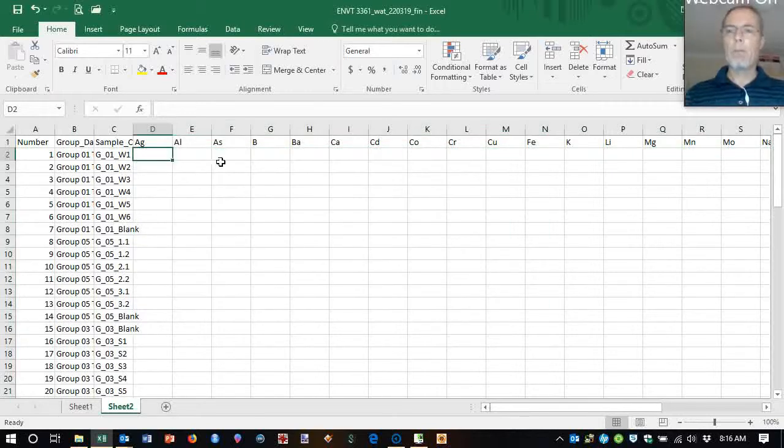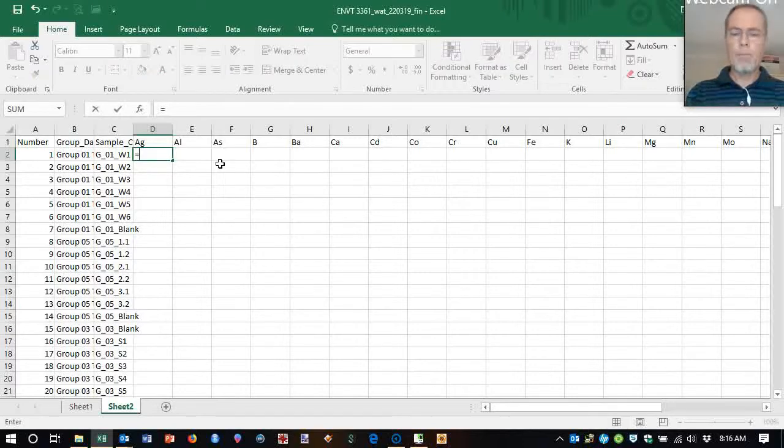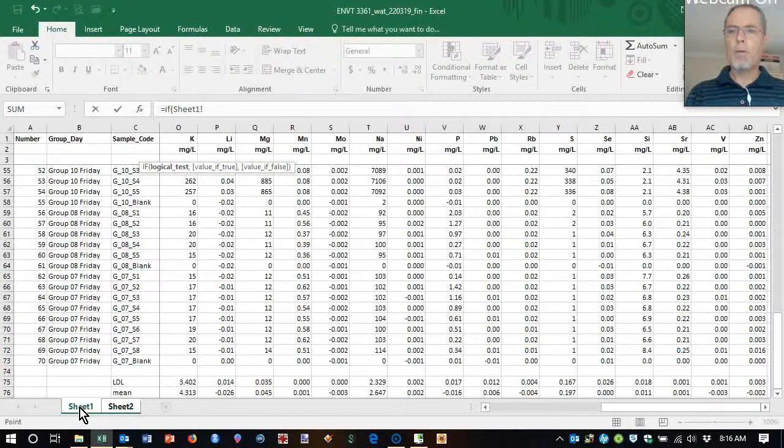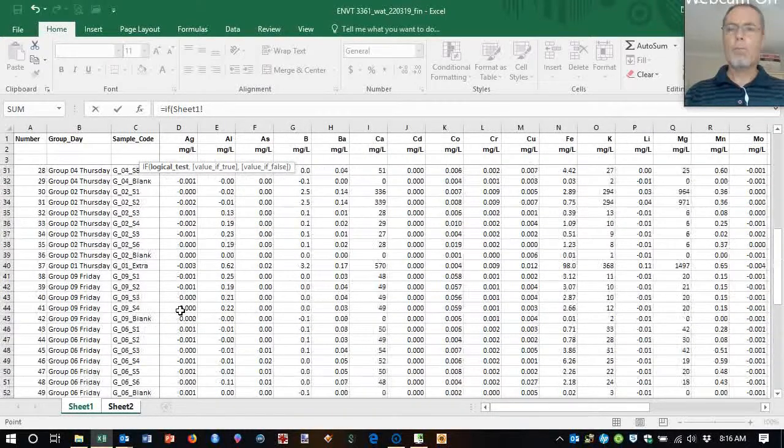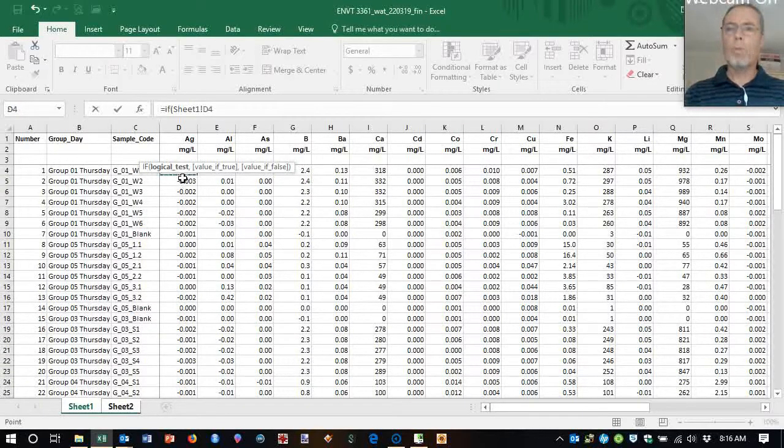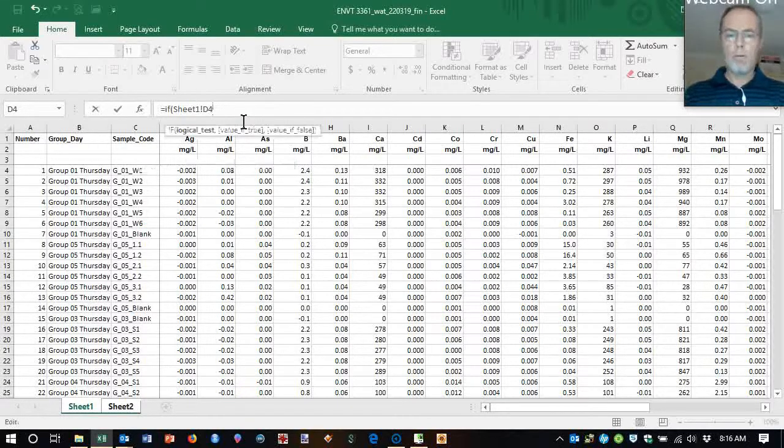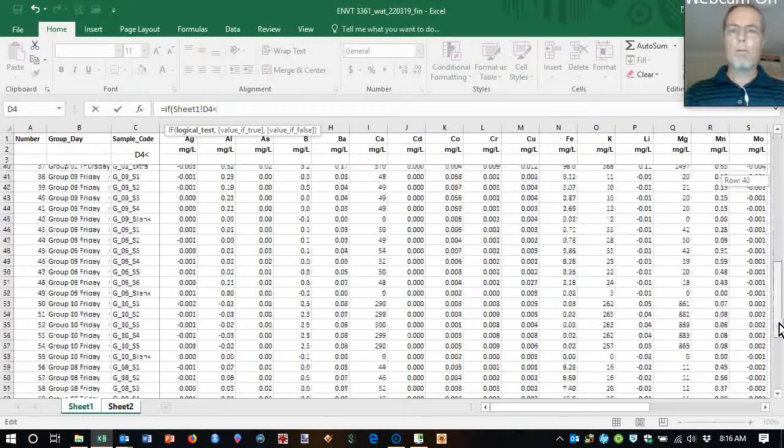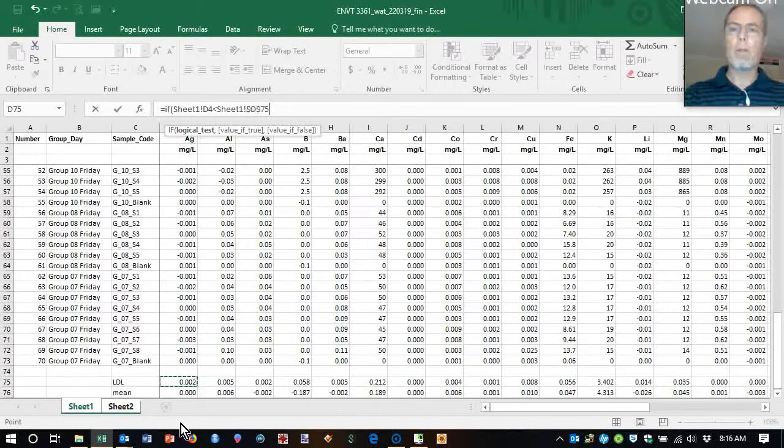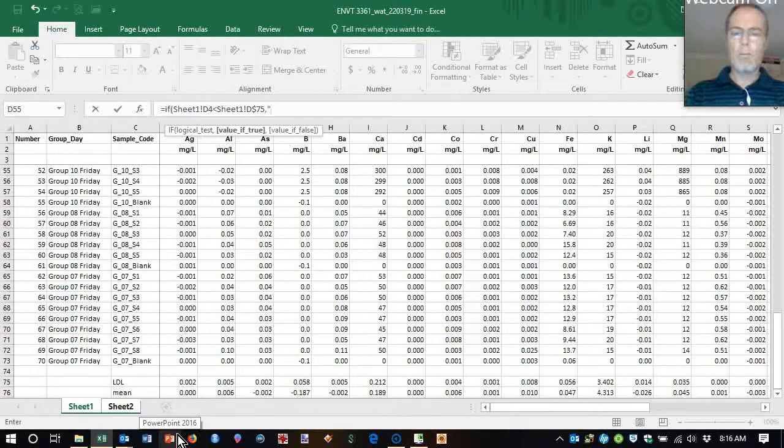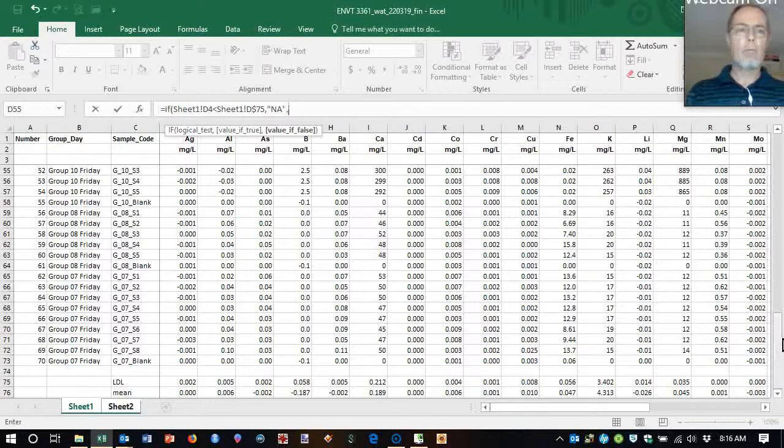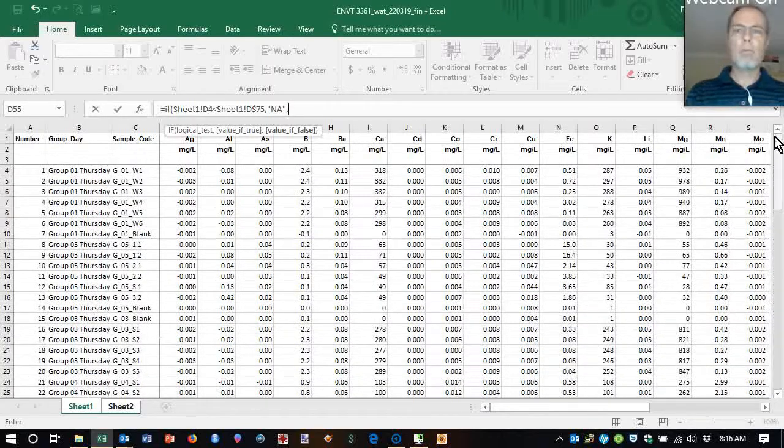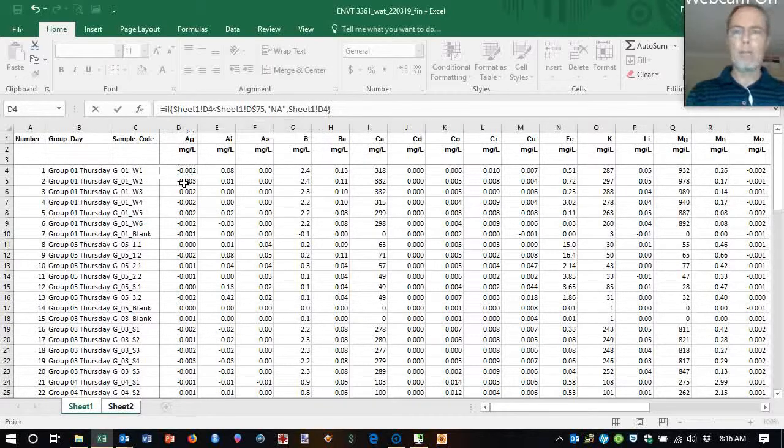So for silver I'm going to say if our value is less than below limit of detection, let's make that, fix that, fix that cell in place. Make that in place, make that N A. But if not, let's just keep it at the value it is for now. This is the first step.